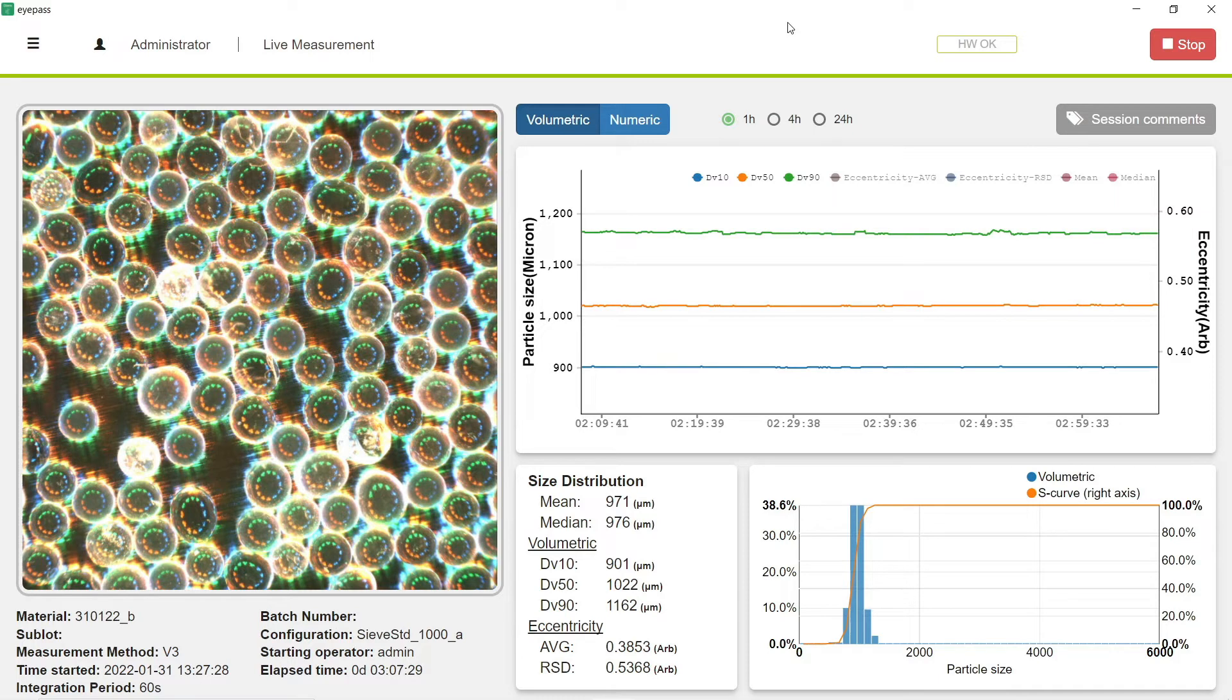If we look at the D50, we have 1022 microns, a very highly accurate result for this type of material with its particle size distribution. And again, we have all the interactions we can have with this software, such as hovering over the charts to see the real-time data as it's happening.